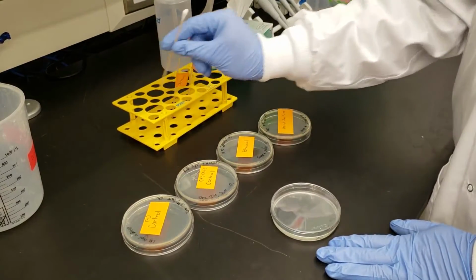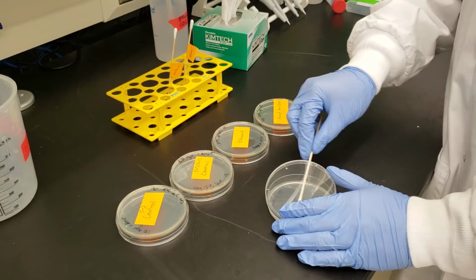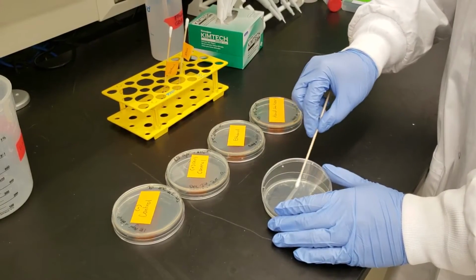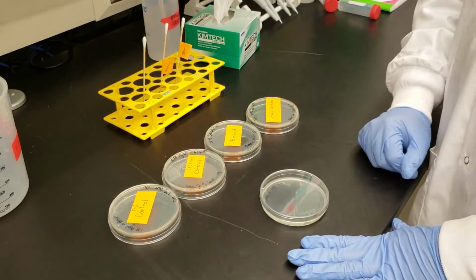So take your swab, carefully lift the lid of the plate just enough so you can get your swab in there, and gently cover the surface of the agar. And that's it. You can do this same process for a whole variation of treatments.